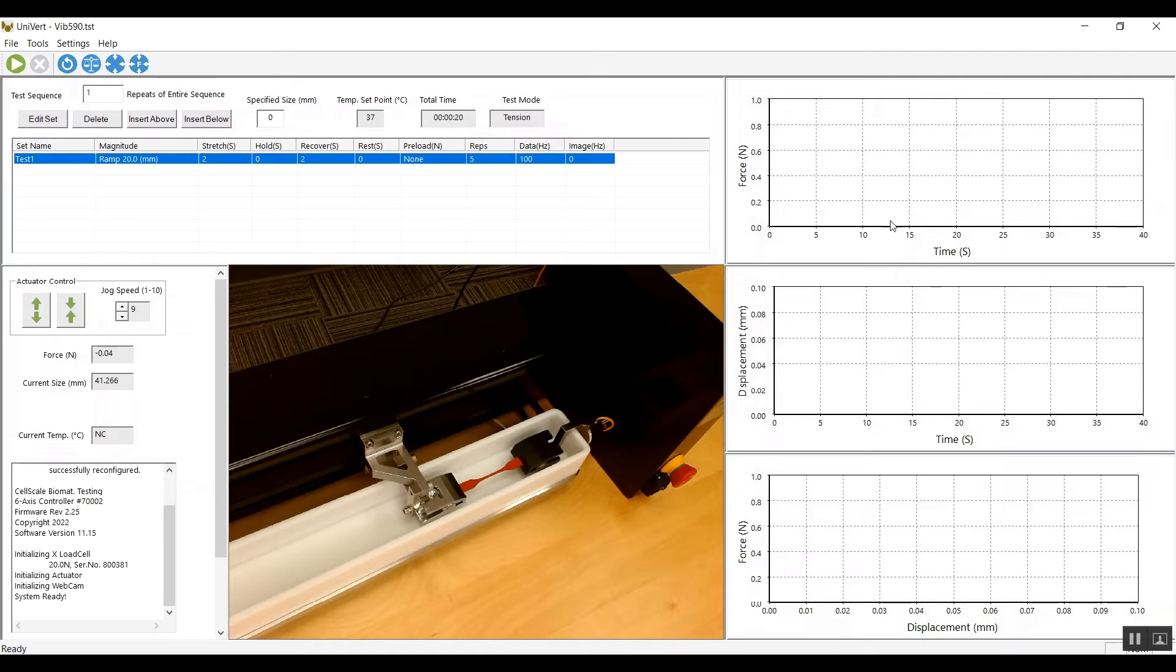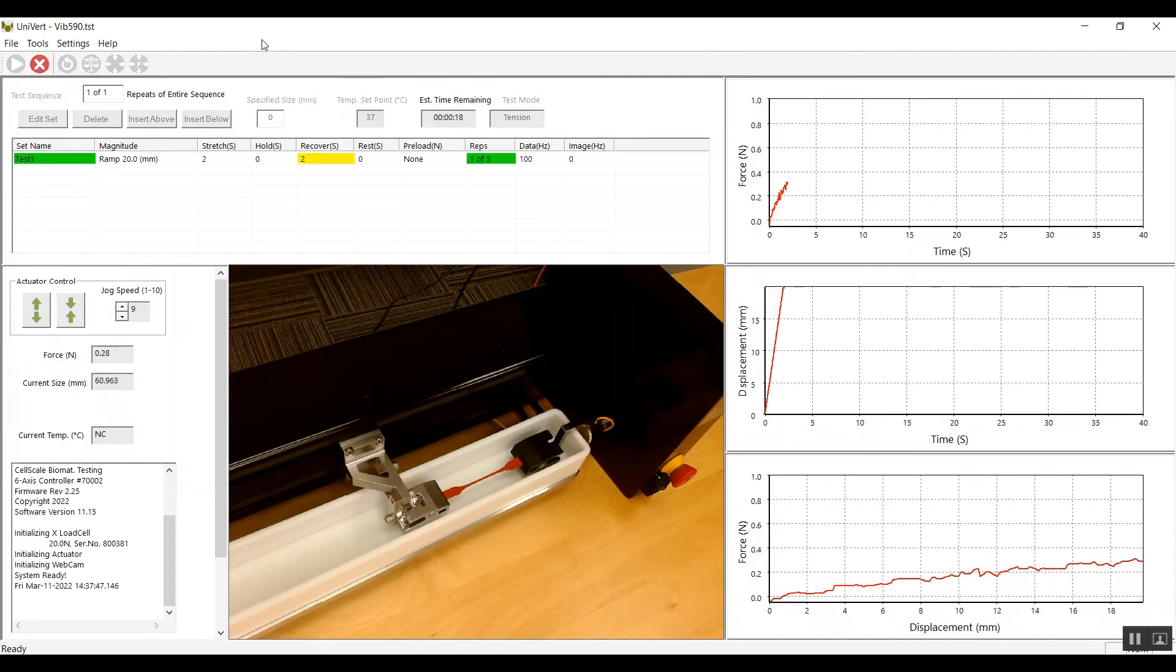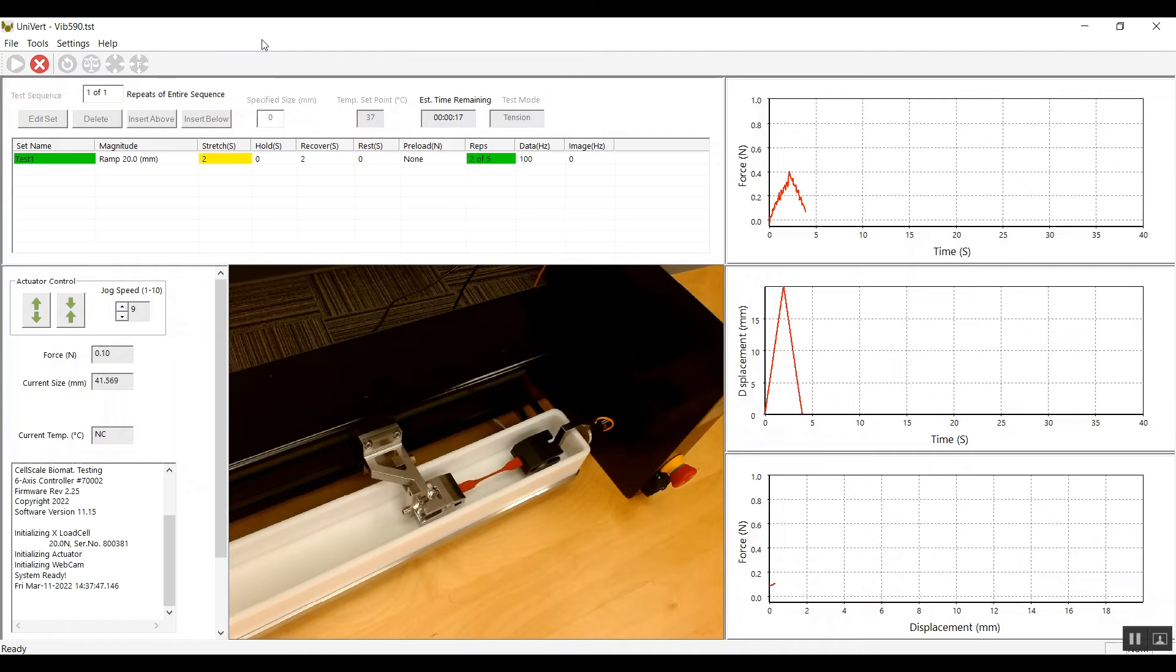On the right you'll see the force versus time, displacement versus time, and force versus displacement graphs. In the center portion you'll see the webcam showing me what's happening. I'm going to start the test now and there you can see it running and you see the live data populating the graphs as we go. This data will also be written to a text file that I can open for further analysis.